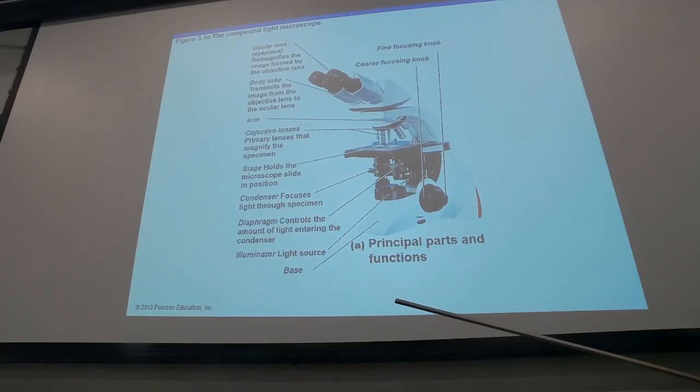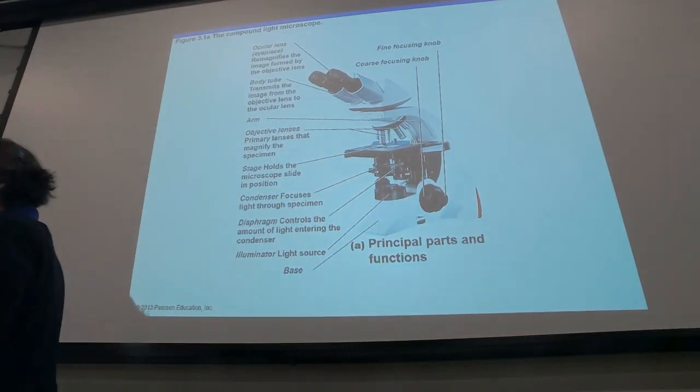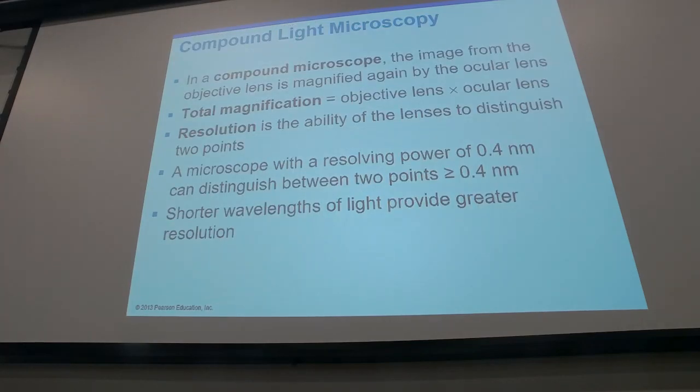So tomorrow we will have the light microscopy lab, and then you will practice focusing objects with the microscope. Most of you already have used it before, but no matter how experienced someone is, we always benefit from practicing more.